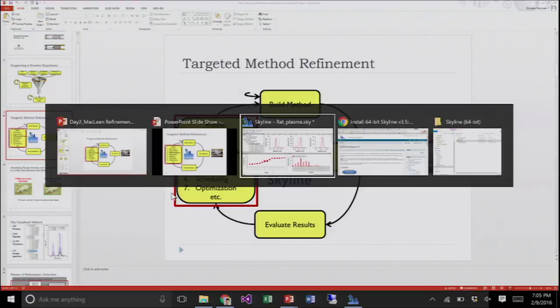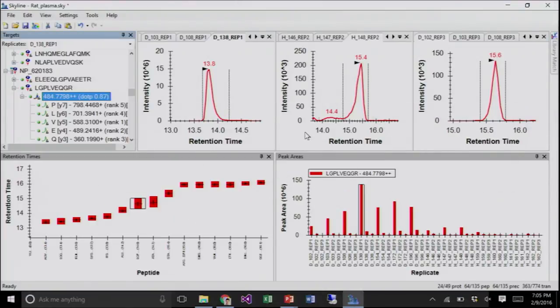So in this case, this would not be a good candidate for a quantitative assay, and it would be hard to get good statistics. If this came up showing that this is a really great biomarker, I would be really dubious, because you look at all of the high measurements, and yes, they're on the disease side, but that's just because the disease side was always measured before the healthy side, and things degraded so much. So we would want to just delete this one too.